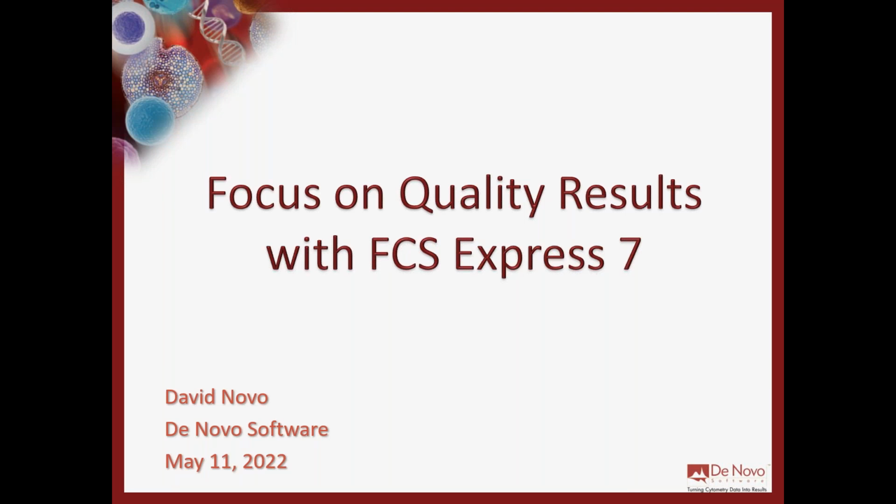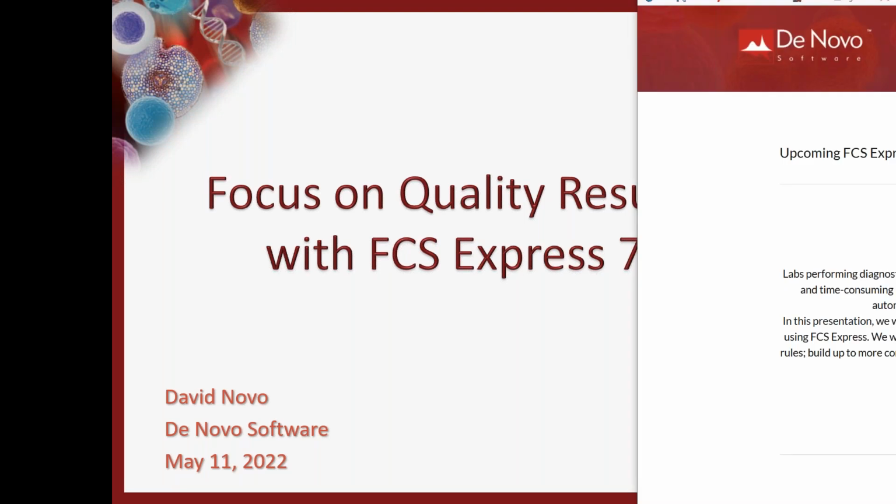Okay, so today, everybody, welcome to our presentation on quality results, how to obtain quality results with FCS Express. This presentation is going to be about 45 minutes to an hour, depending on how many questions we get. And this is not a presentation about how to use FCS Express or learning different features about FCS Express or step-by-step instructions on how to do things in FCS Express.